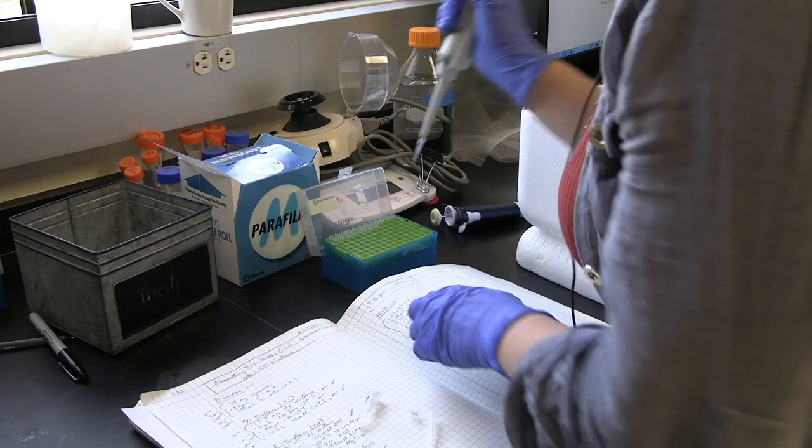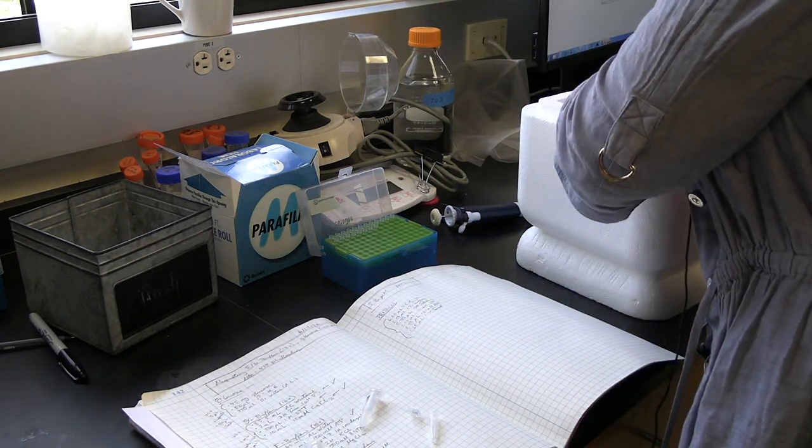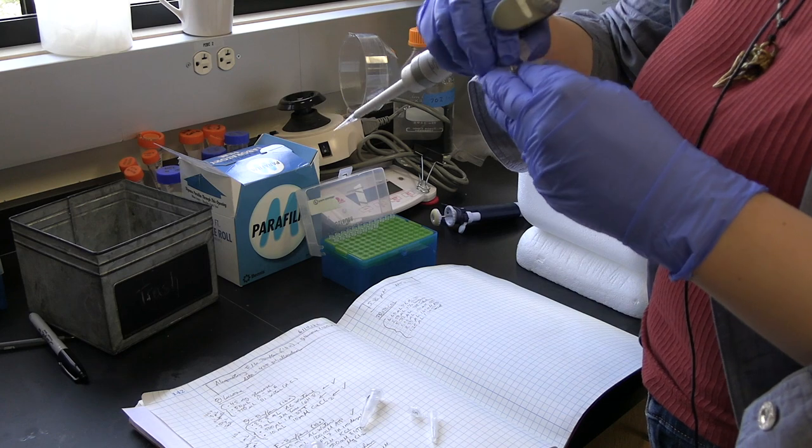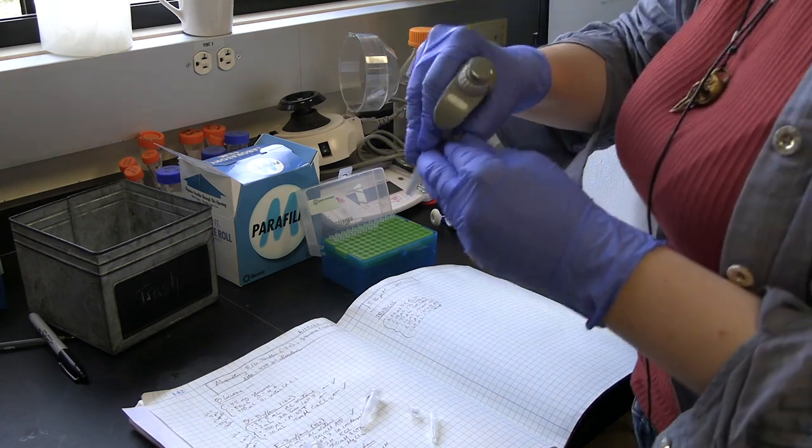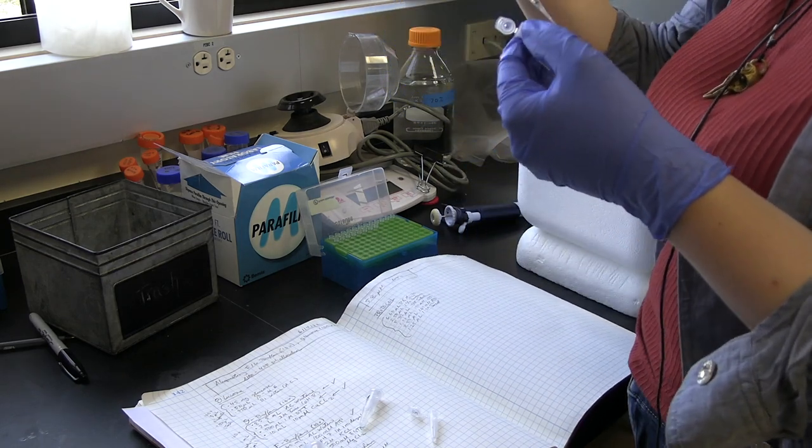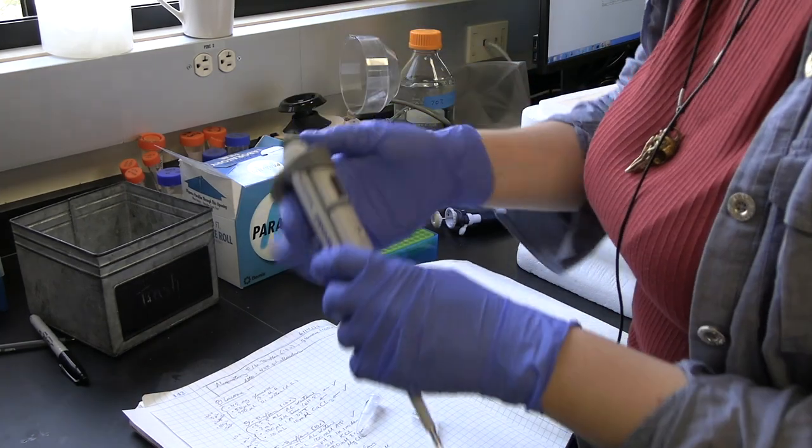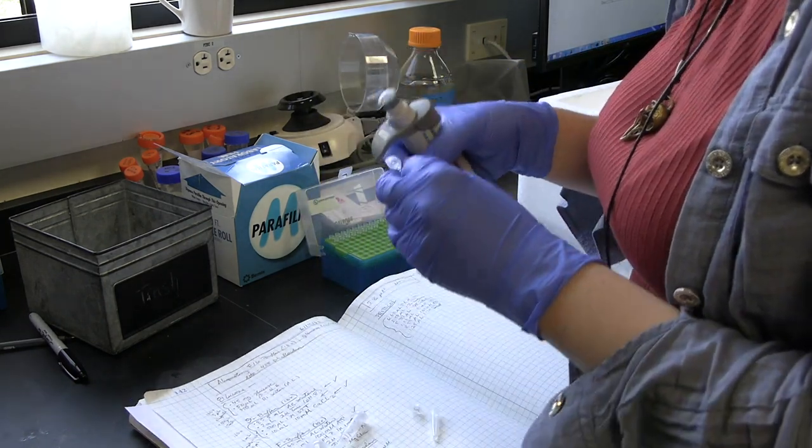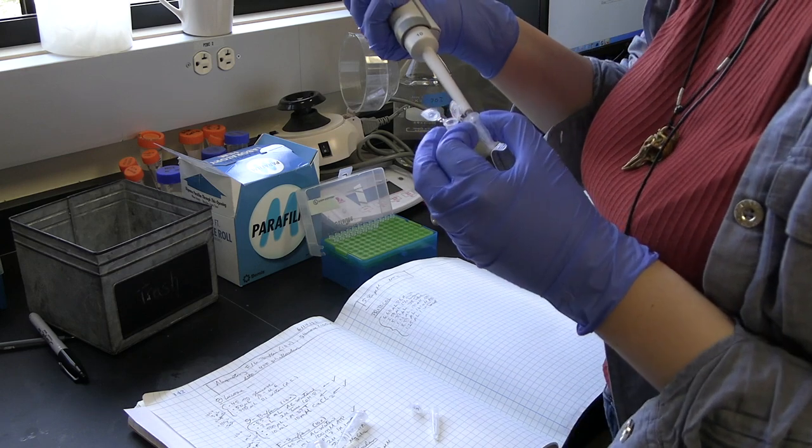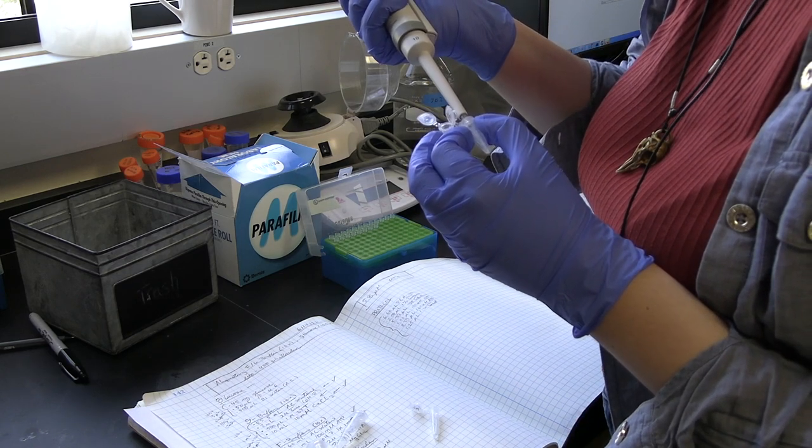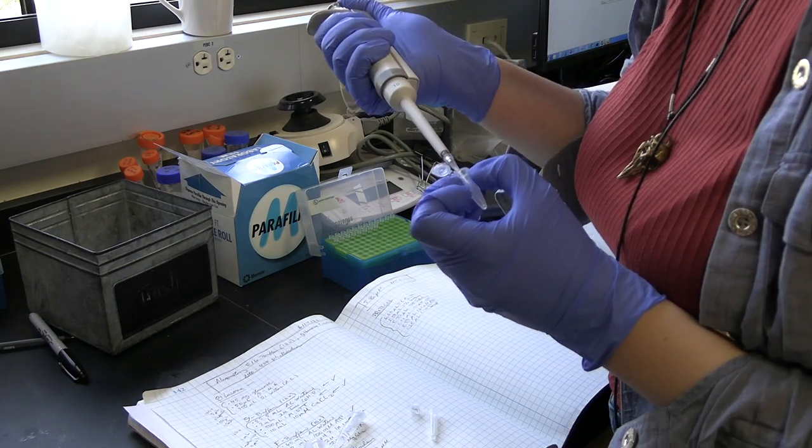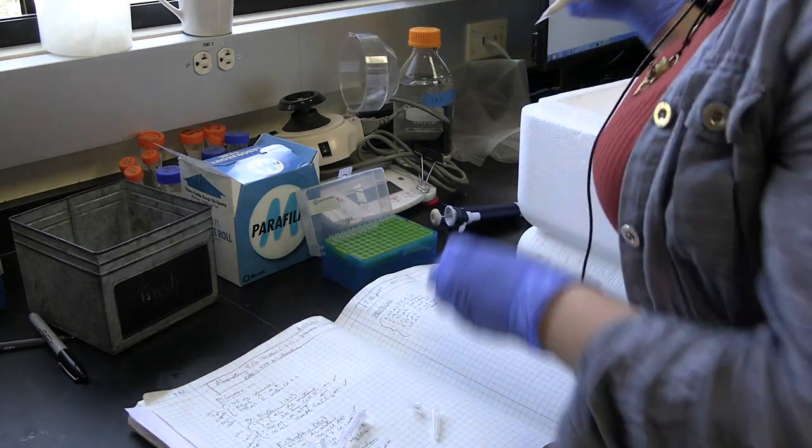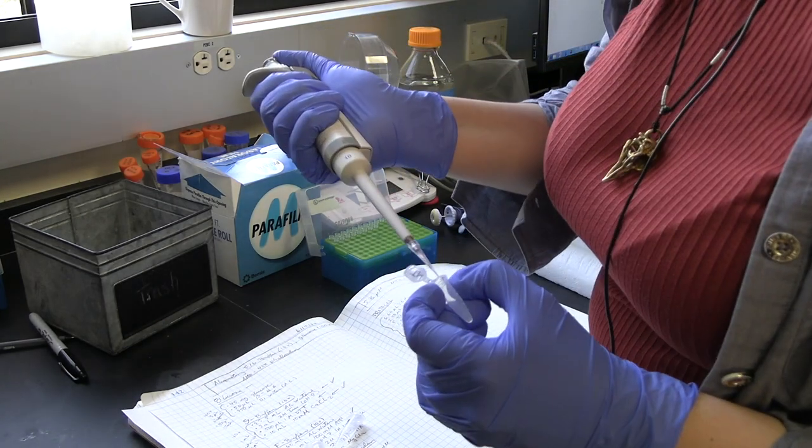Next thing we add is 5.32 microliters of 488 labeled tubulin. That means the microtubule dimers are labeled with a particle that fluoresces when 488 light is shined on it, and it emits at a longer wavelength, which will be green. There isn't enough in one aliquot because we make our aliquots around 3 microliters large, so I took a second one out of the minus 80 for this particular network. Add that to the sample.